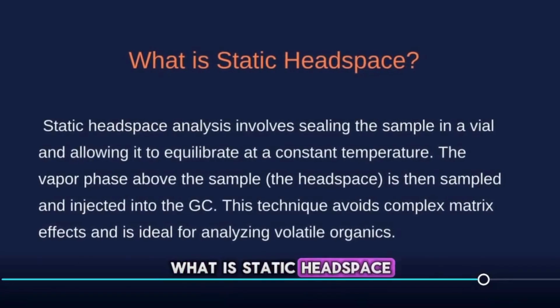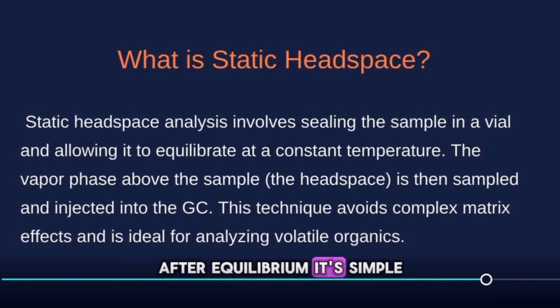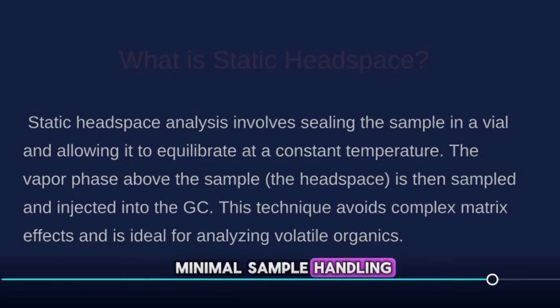What is static headspace? Static headspace analysis collects vapors above a sample after equilibrium. It's simple, clean, and avoids matrix interference during injection. Only the volatile fraction enters the GC column for analysis. It's perfect for detecting solvents, VOCs, and impurities with minimal sample handling.